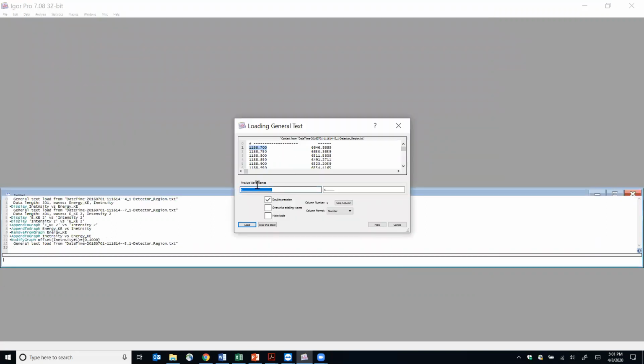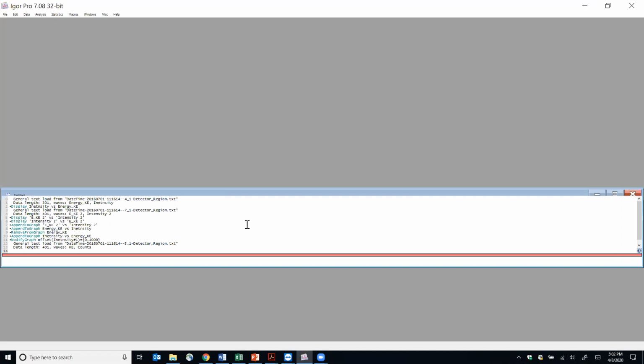This one looks like the kinetic energy of some element. I don't know what element this one is, kinetic energy, for example. For XPS, when you do it like this, you need to rename the name here, if it's carbon, oxygen, palladium or anything. And here is the count or the intensity, and you load your waves. You know all this, right?